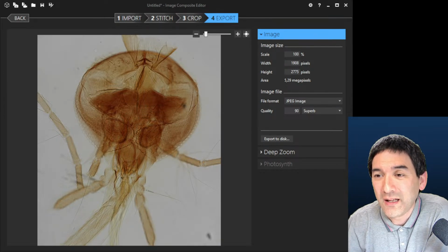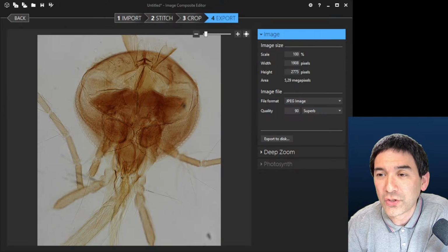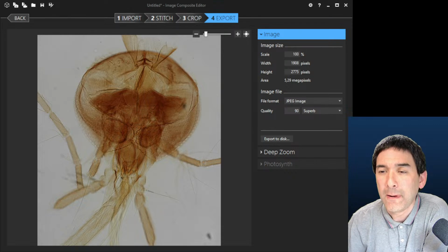I am a developer and currently working on a software that can preview the live images of a USB camera and can also do focus stacking. Do you know a software for stitching that has an API?